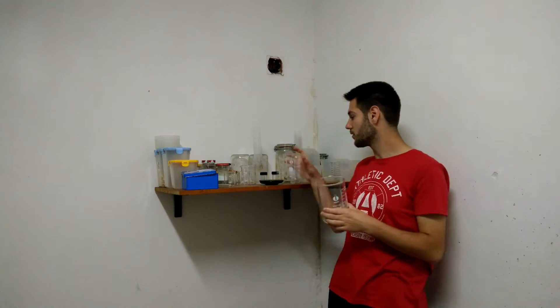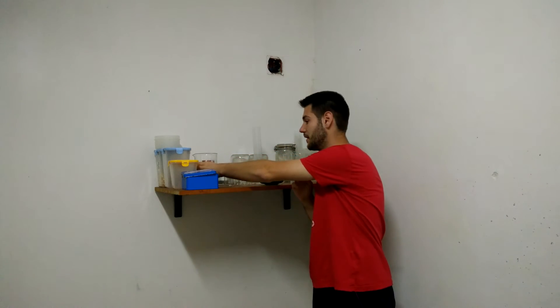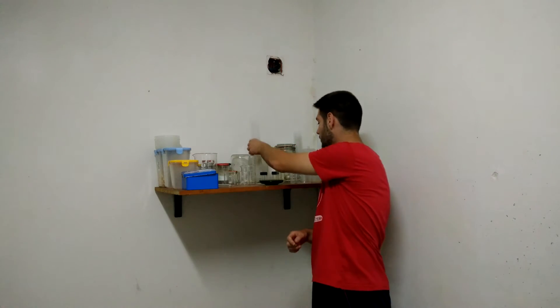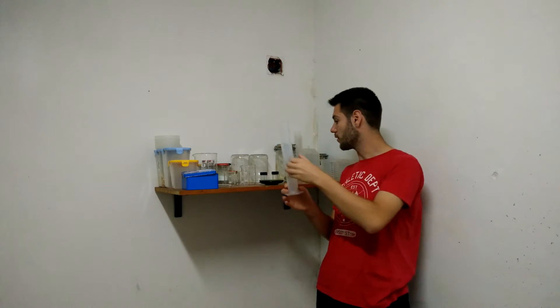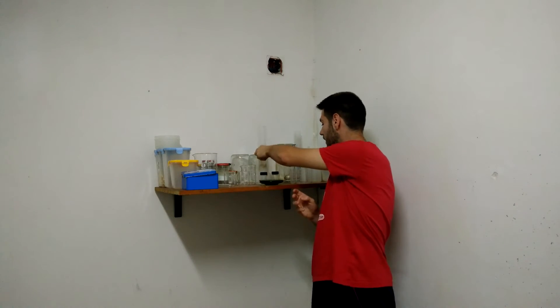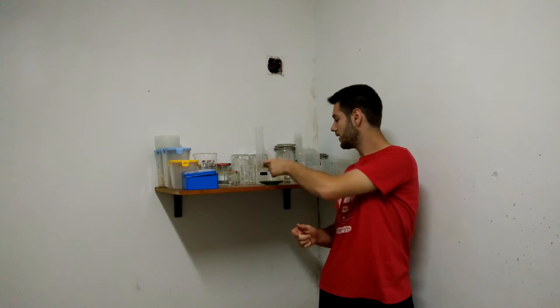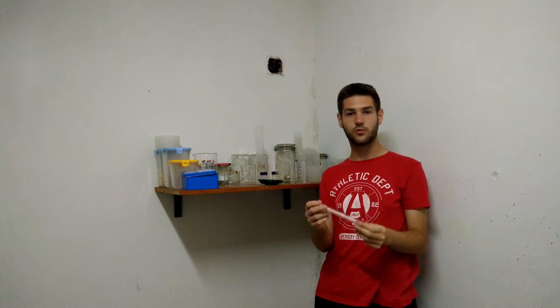It is special because it resists high temperatures. In fact, you can heat them in the oven without cracking them, which with some other glasses isn't possible. Other important things are, for example, our cylinders, and we have also some small cylinders to accommodate these. Then we have some small plates, always made out of glass, and we don't have to forget our glass tubes, which are commonly used in many experiments.